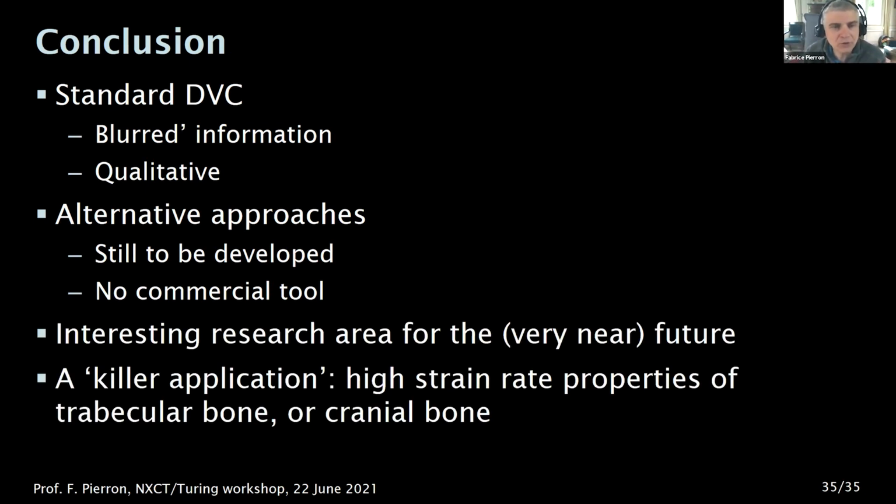And a killer application would typically be high strain rate properties of trabecular bone or cranial bone, where the structure, I mean, the material in itself doesn't exist. It comes with the structure.